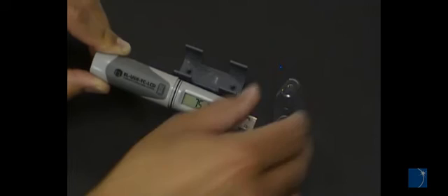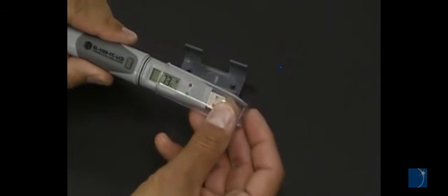EL-USB loggers include a plastic cap to protect the USB connector. A rubber gasket helps keep out dust and moisture.